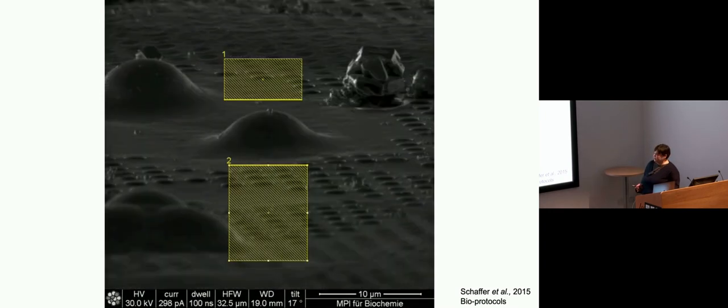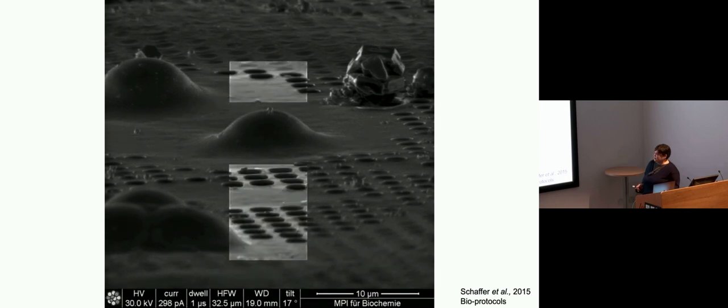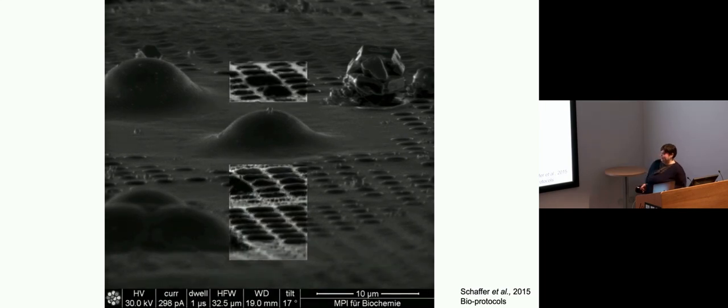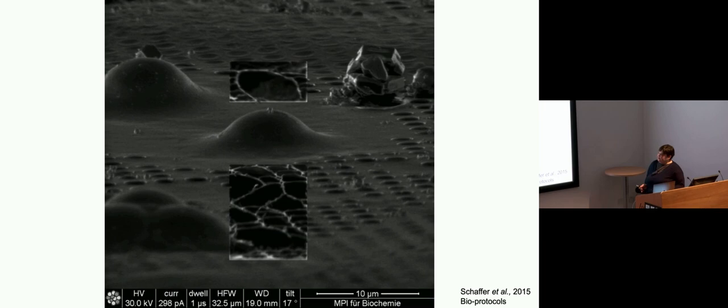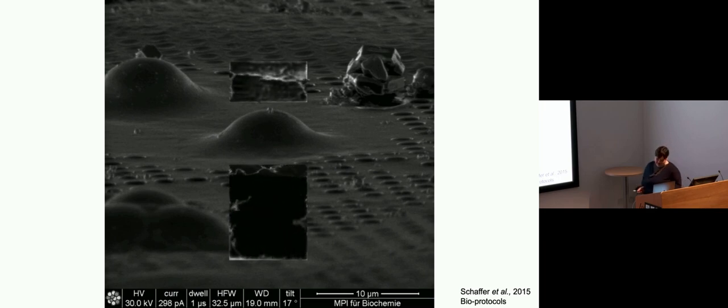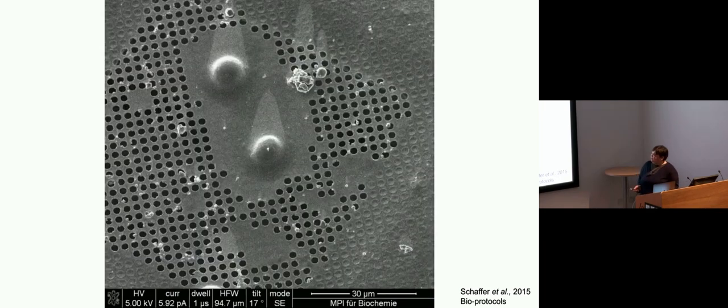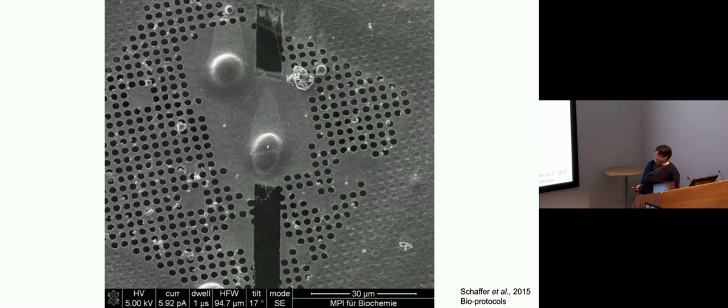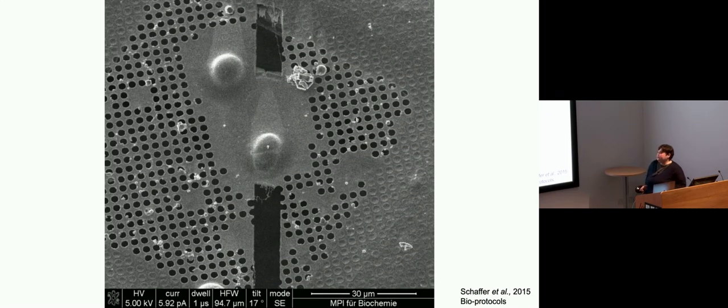Which in the SEM looks something like this. These first cuts, in this case, because the cells are quite small, haven't even gone onto the cell. But they're quite important for opening up space later for the tomography.